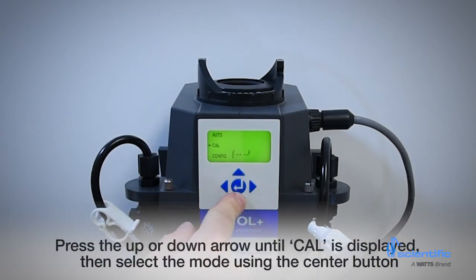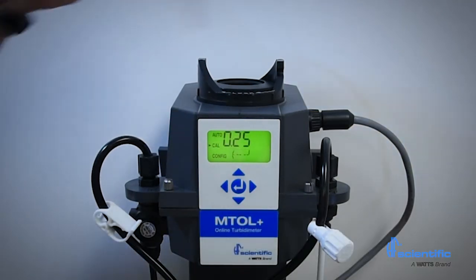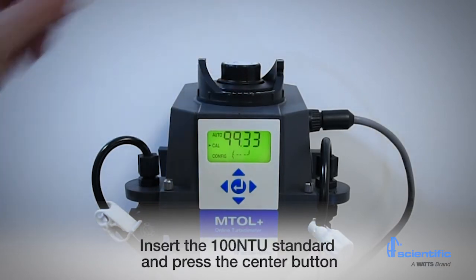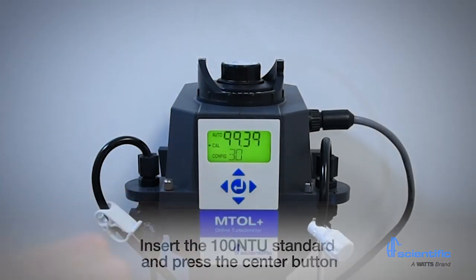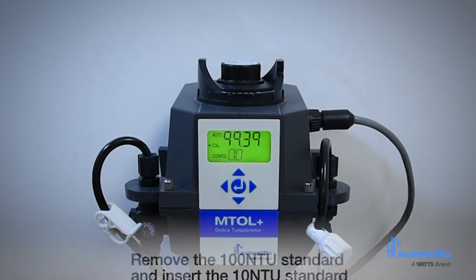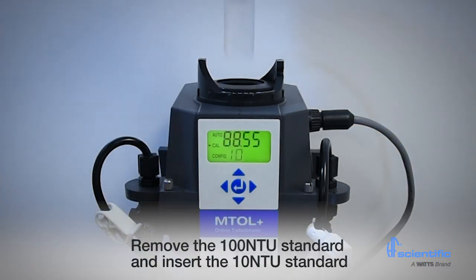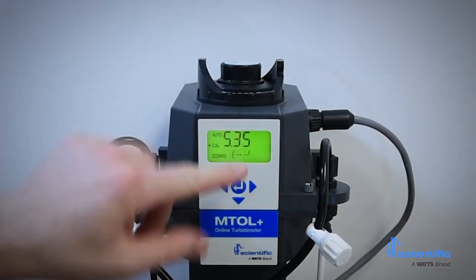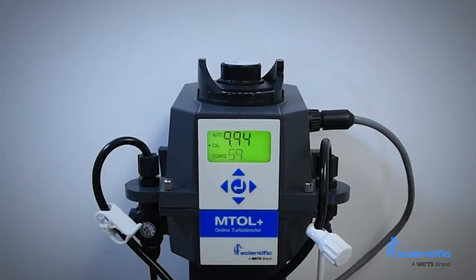To start, press the up arrow until CAL is displayed. Then select mode using the center button. The instrument will display 100. Insert the 100 NTU standard and press the center button. The instrument will count down 30 seconds and then will display 10. Next, remove the 100 NTU standard and insert the 10 NTU standard. Press the center button. The display will count down 60 seconds and then display 0.02.